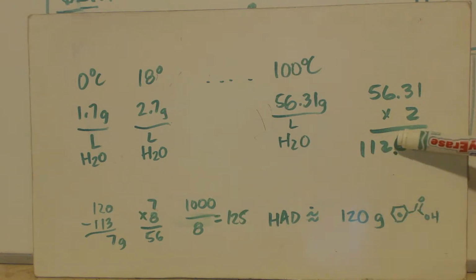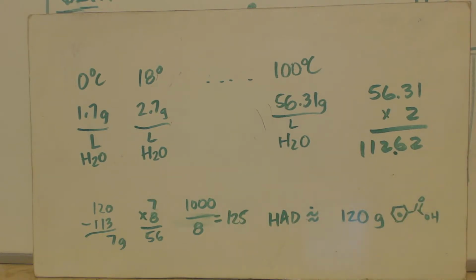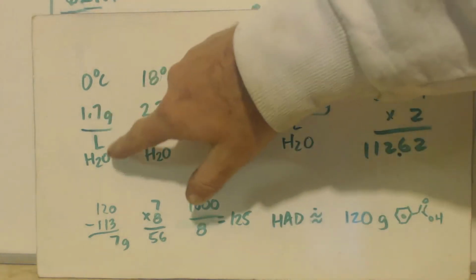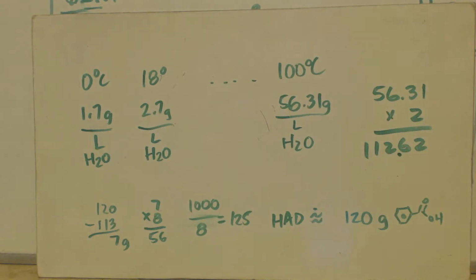That is total 2,125 milliliters. I used 2,500 milliliters, so I added in an extra, whatever, 375 milliliters. So that would account for a gram or two. Also, that's almost a half a liter, so that's almost a gram there.